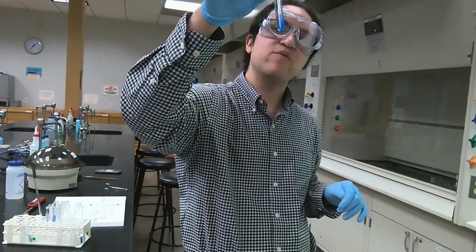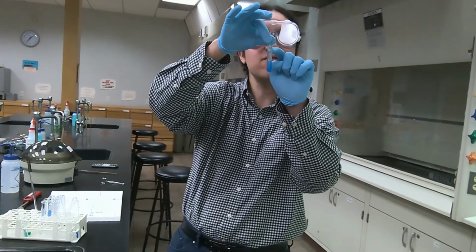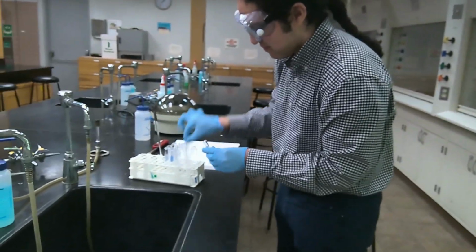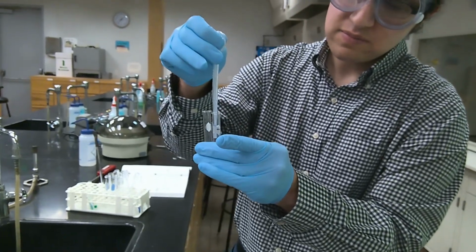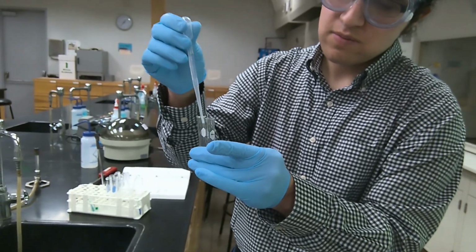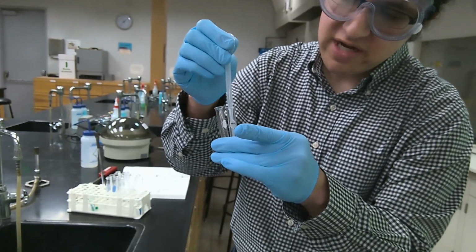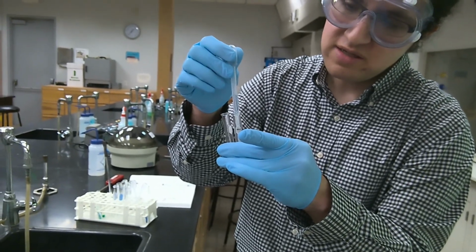Now to verify that we've completely precipitated out all of our copper hydroxide, we're going to carefully decant and pipette off our top supernatant liquid. We're being very careful not to accidentally pipette over any solid.